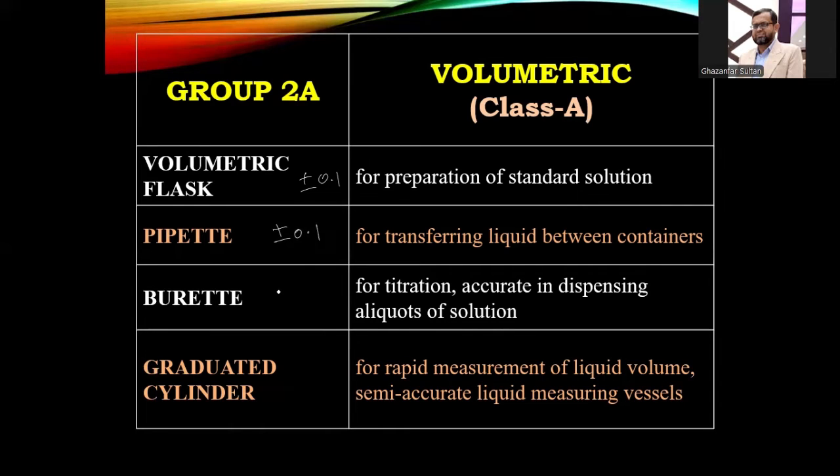Burette. Burette is specifically for transferring aliquots of solution for titration or some other purposes. It also has a standard deviation of 0.1, so it is also highly accurate.